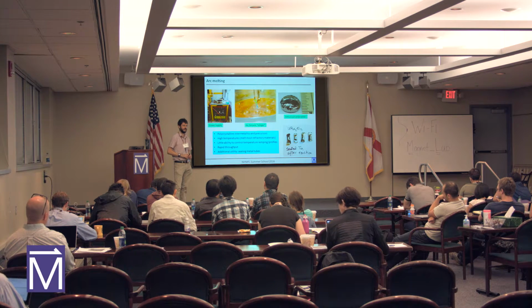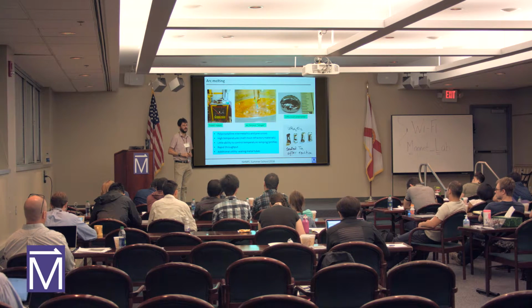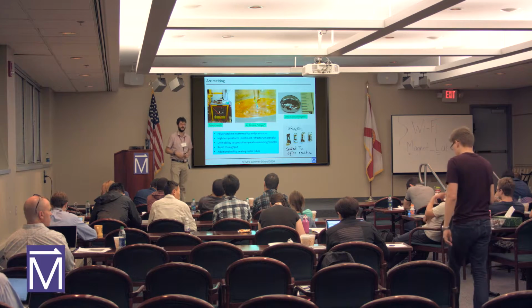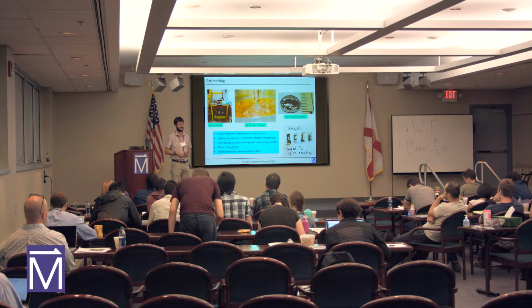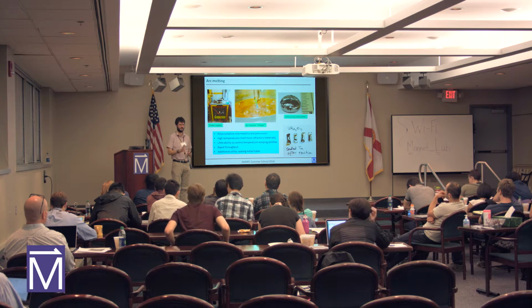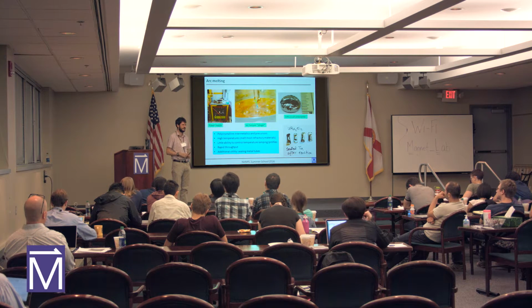My experience has been that as you react it more and more, it becomes more and more tight packed, because it's the same stuff packing in with the same stuff. It can become hard, yeah. But a lot of these things, if you had a single crystal of it, are pretty brittle. Well, not always, but they can be very brittle. So it means that you can break it down into very small particles. It would be material specific, I think. If you tried to ball mill some iron arsenic stuff, it would be a different story. It's more malleable.